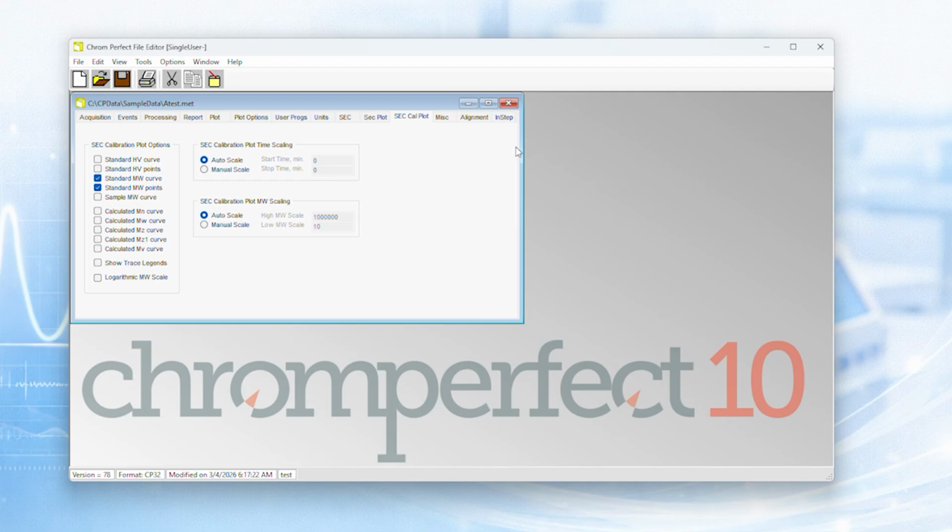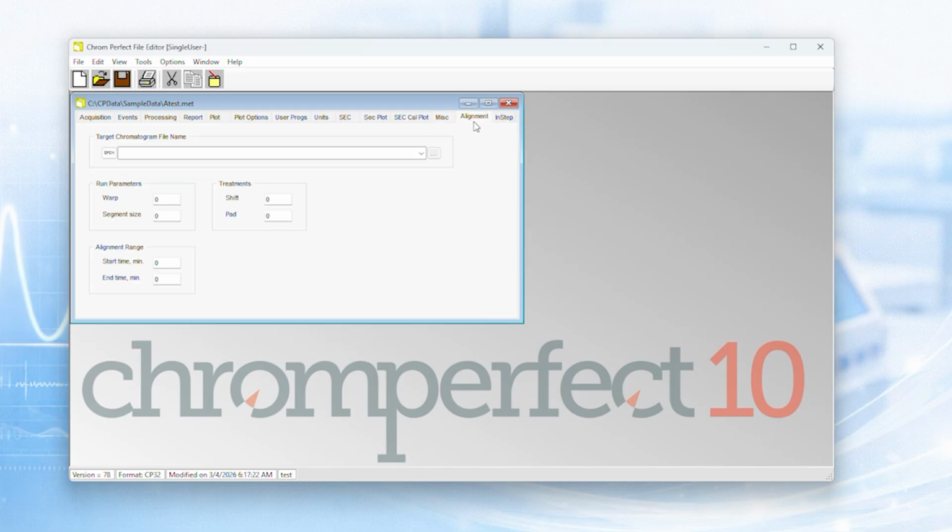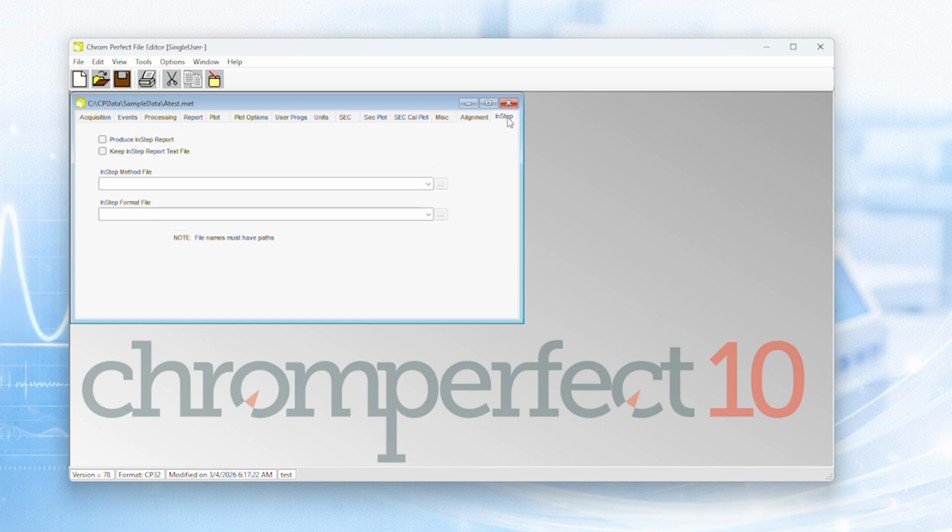You will see the Miscellaneous tab. This tab contains general method metadata and minor configuration settings. It does not fundamentally alter acquisition or integration logic. Finally, there are two application tabs labeled Alignment and Instep. These are advanced or add-on tools used in specific applications. They are acknowledged here so you are aware of them, but they are not part of the core beginner workflow.